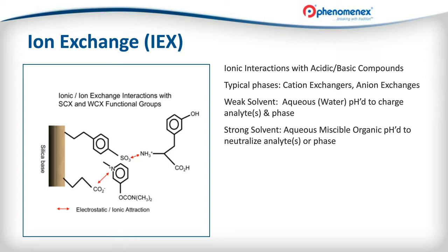The reason why this is important for SPE is because SPE is on and off. And so if we have this very, very strong retention mechanism to capture our analytes of interest, that means that we will get better recovery first and foremost, and that we're able to wash with an even stronger solvent, typically 100% organic, which is going to clean our sample up better, going to give us better matrix effect and better recovery. So in addition to the data analysis portion, you're also going to get better column lifetime. You're going to get less instrument maintenance required. So in general, ion exchange is kind of the gold standard of gold standards.